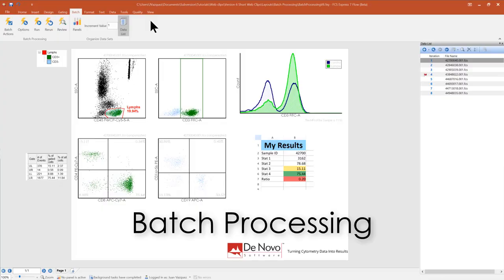To help automate your workflow, FCS Express offers Batch Processing, which allows you to analyze multiple files consecutively and to export your data into multiple formats with a single click.